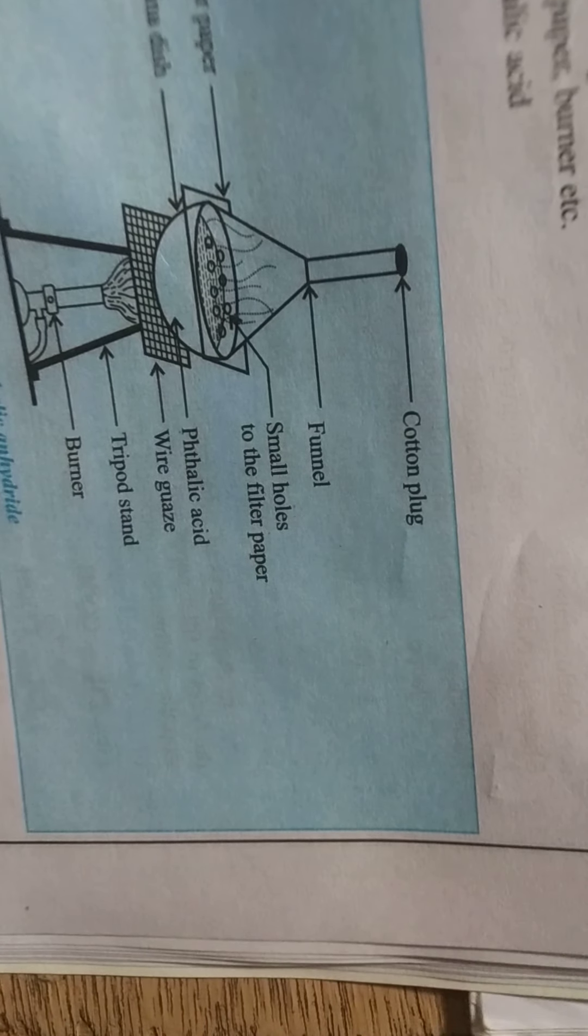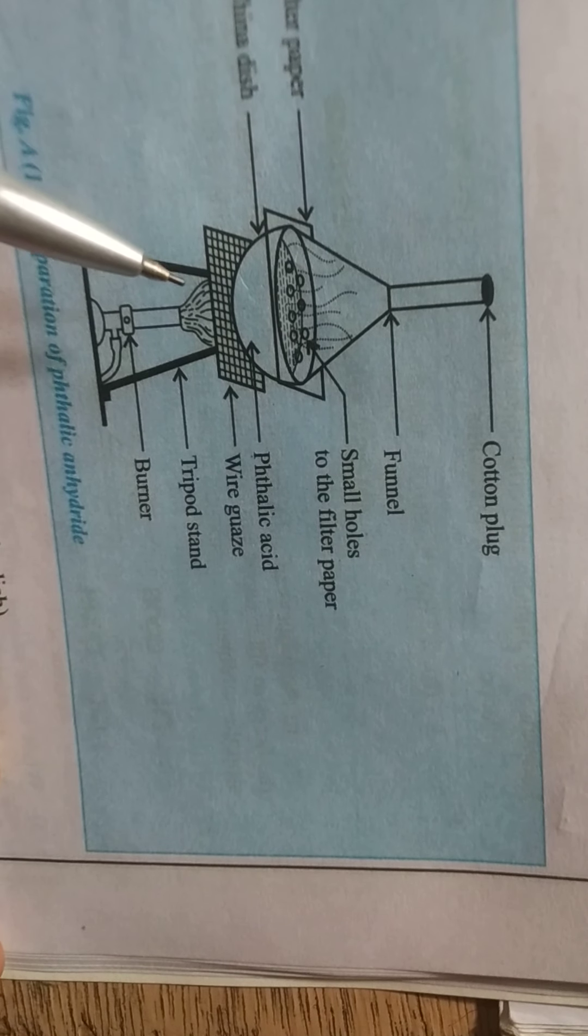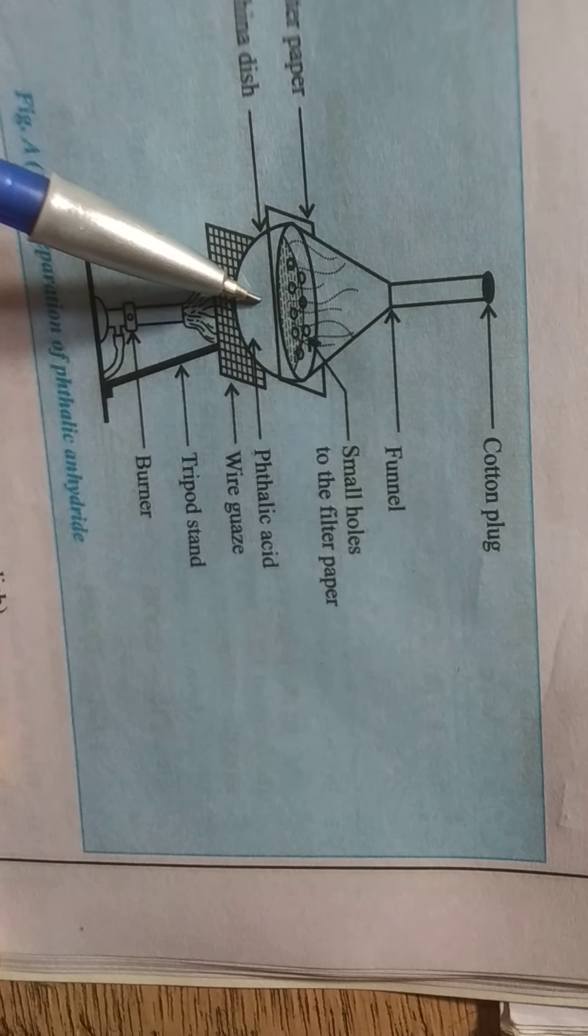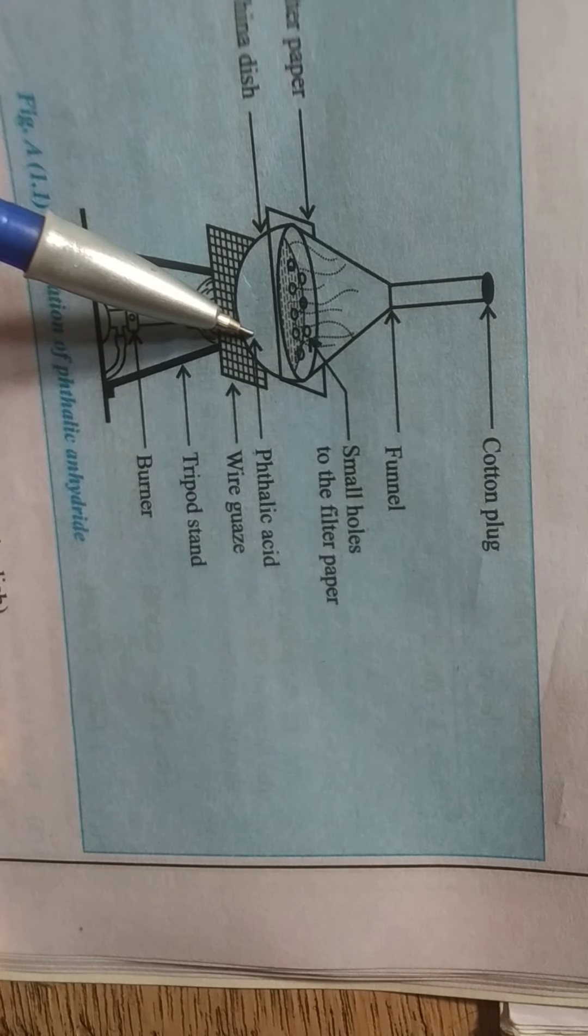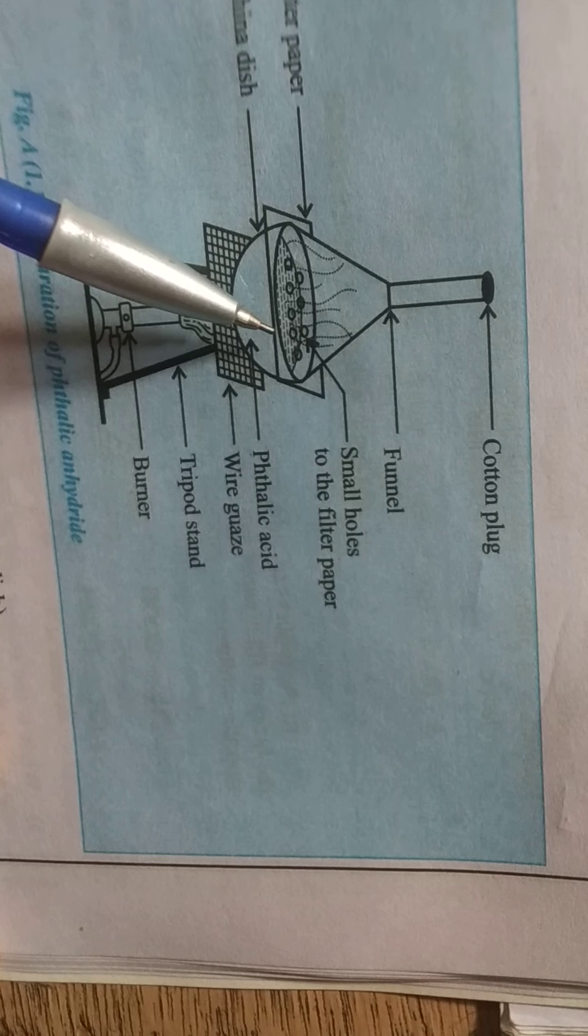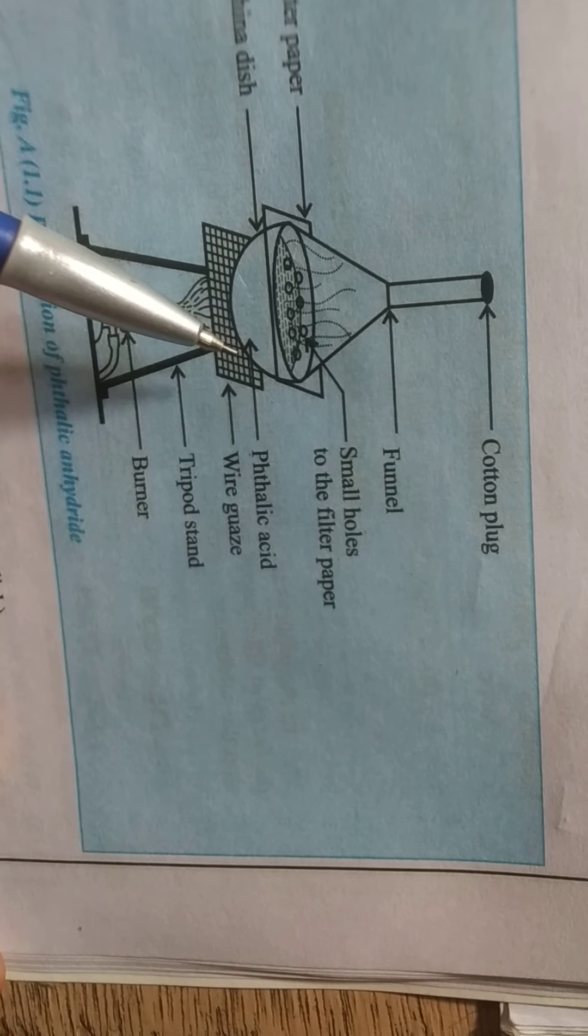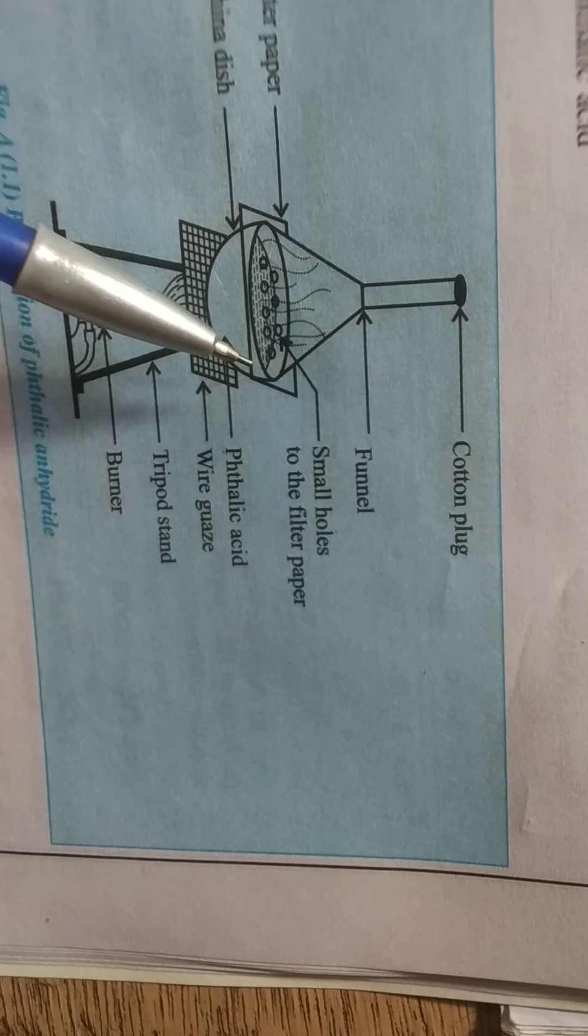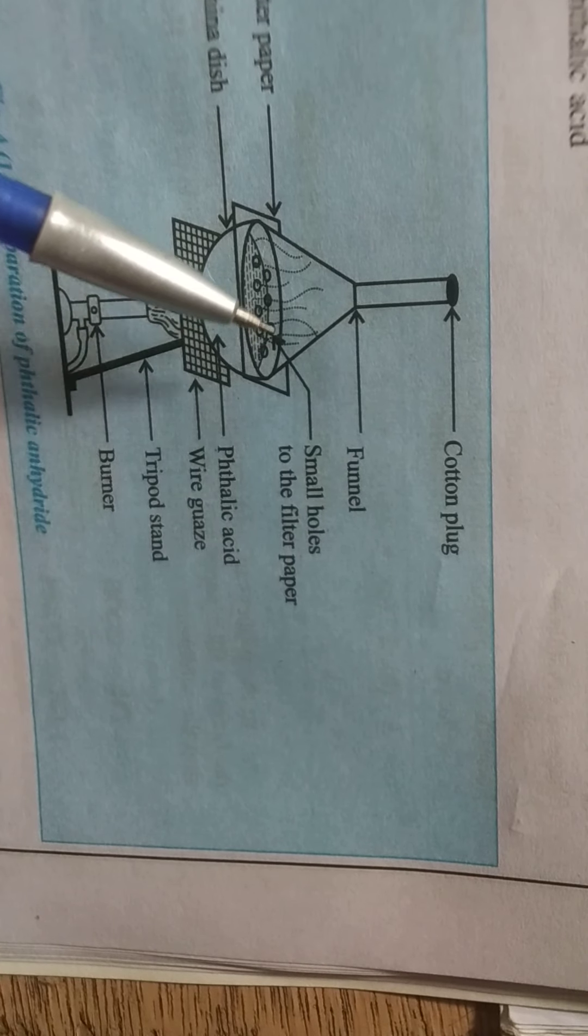We will use the process of sublimation. In sublimation, solid form of phthalic acid in china dish is slowly heated and evaporating dish shows that dehydration takes place. Fumes of phthalic anhydride are obtained which are later condensed to obtain the crystals of phthalic anhydride.